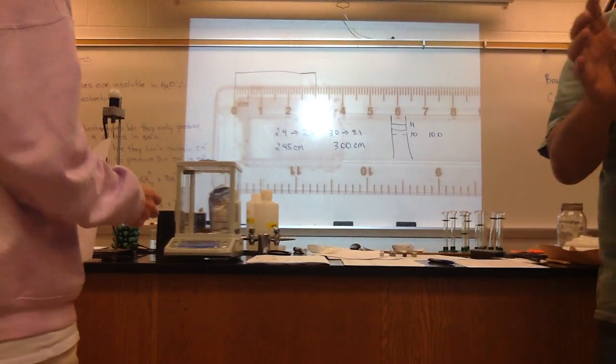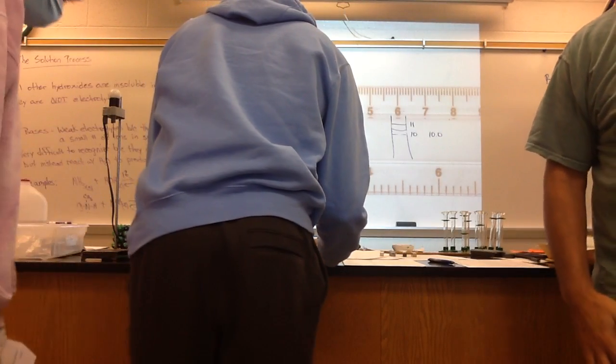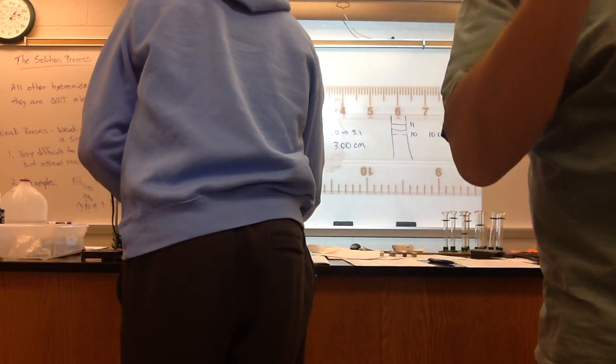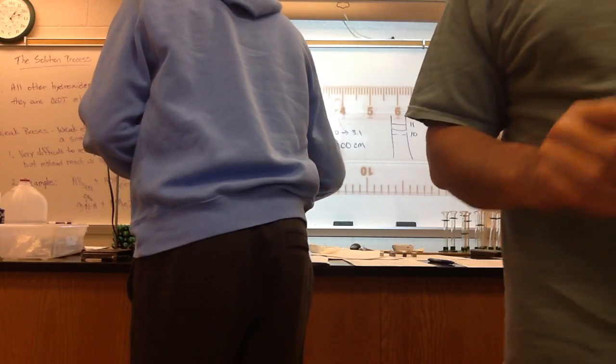All right, for those of you at home, we're going to stop it now. You have a virtual lab. If you're full-time virtual, I just wanted you to be able to see how to measure accurately. So when you're looking at the pictures online, measure the volumes in the graduated cylinders accurately, use the ruler accurately. One past whatever the smallest line is.